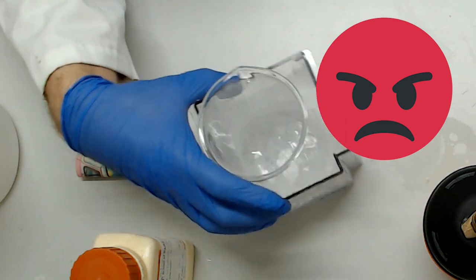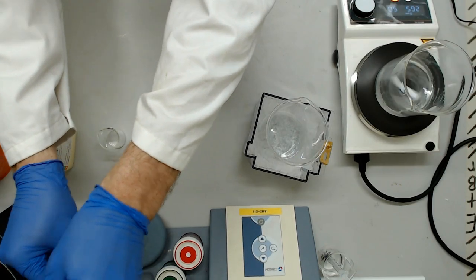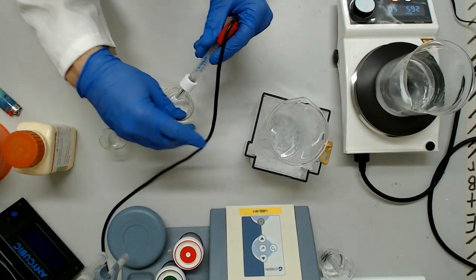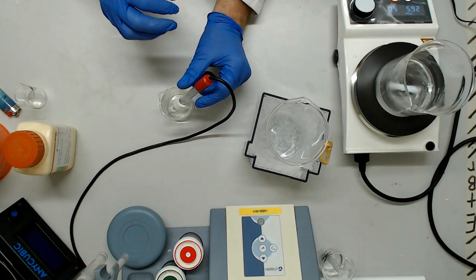Seriously, cover your wrists. I think our lab needs elbow length gloves to keep this dude safe. Time to bring out the pH meter. Getting the pH right is much more important than getting the salt correct to the fifth significant figure.